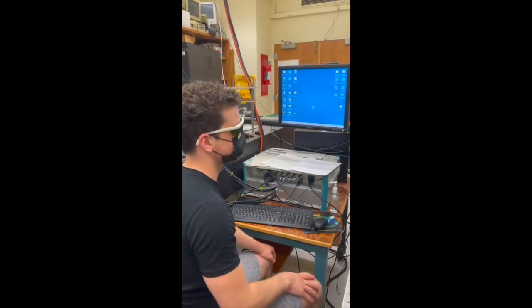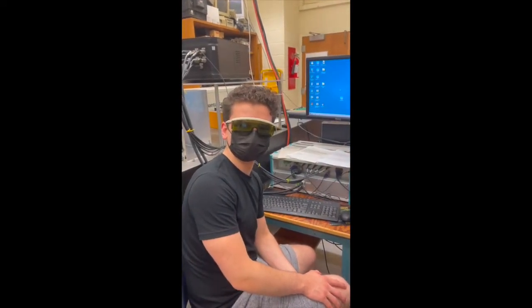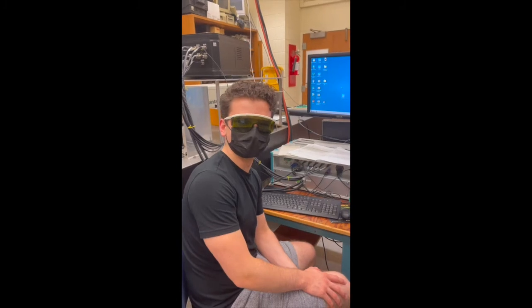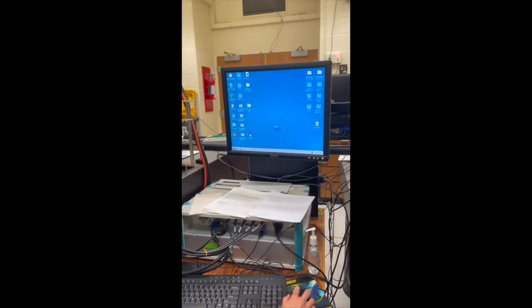So this is a pretty old version of Windows, but it's easy to launch the software that runs the spectrometer. It's called ESA. It's that icon right in the middle of the page. So why don't you just go ahead and open that. Cool.